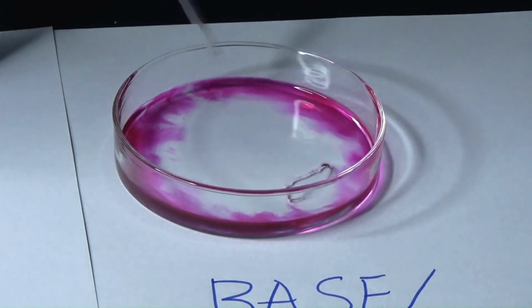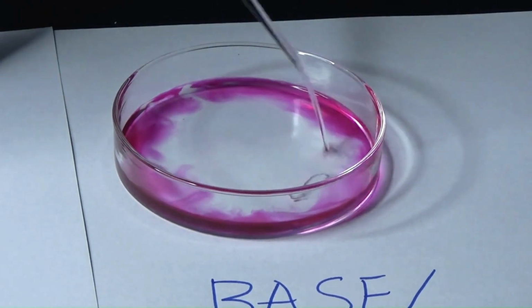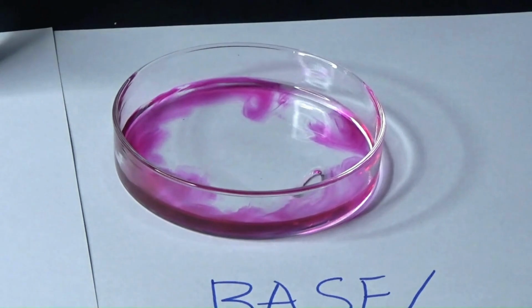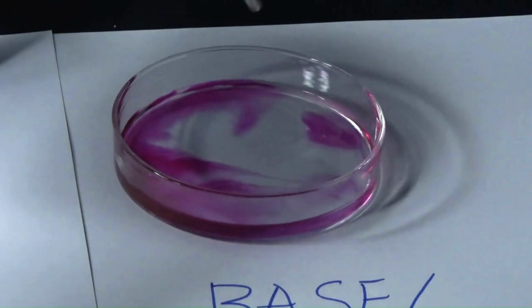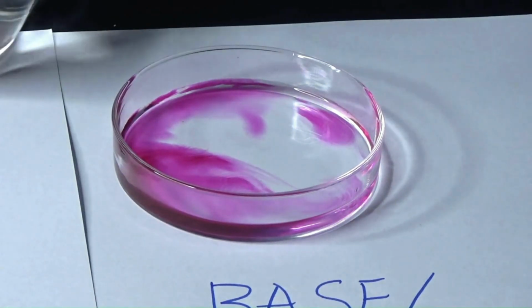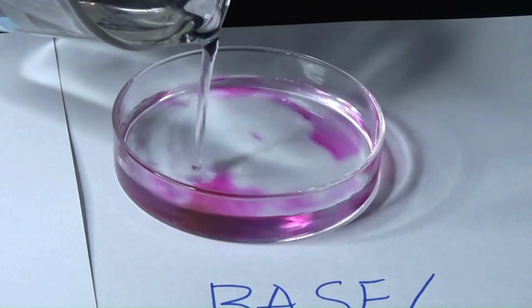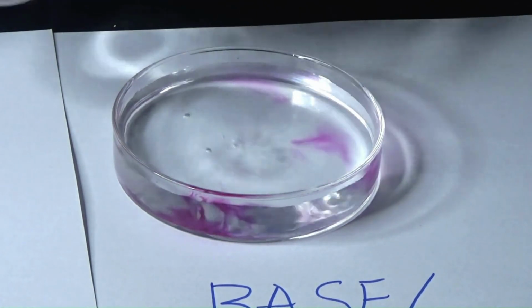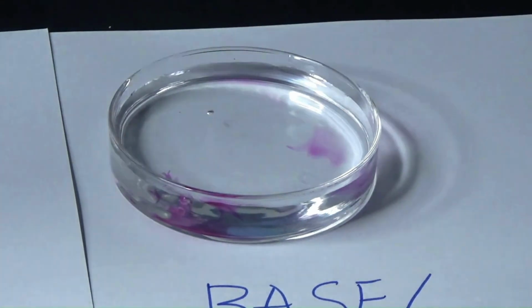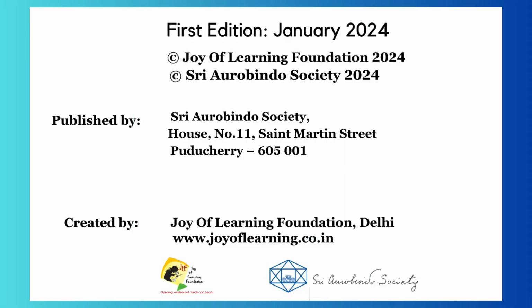As we keep pouring more and more acid, the color keeps vanishing more and more. And let's see, we'll put more here and see the effect. Looks like some more acid is needed, so we will pour directly, and as we pour, all the base is neutralized by the acid till we are left with nearly no color, showing that most acid and base have been neutralized to give us plain water and some salt.